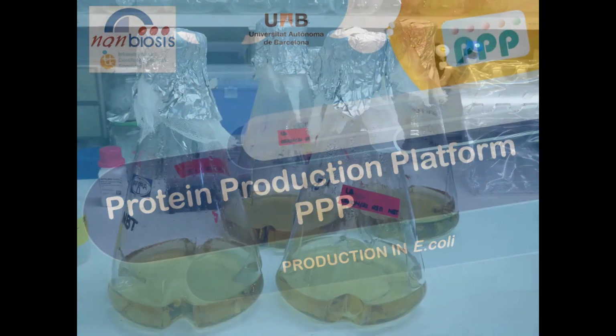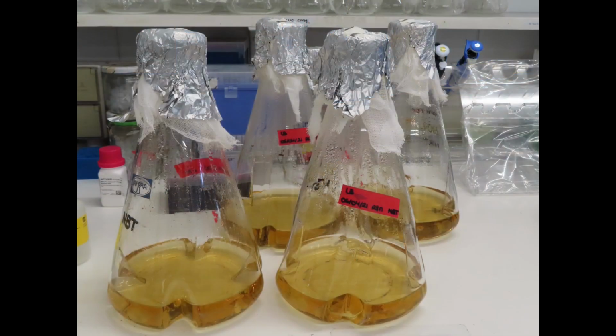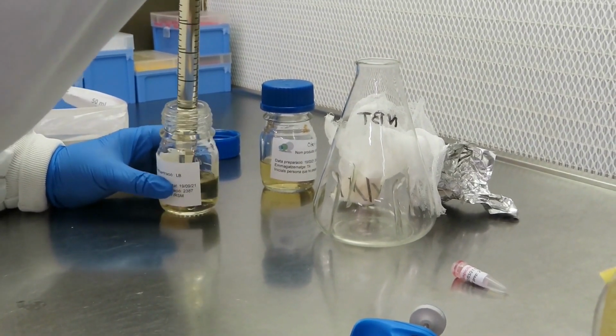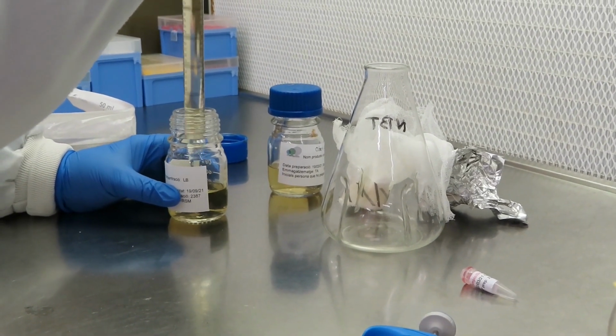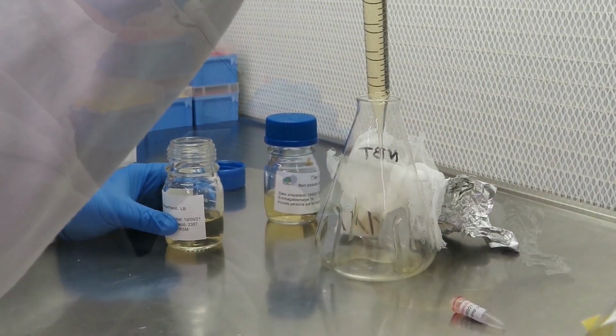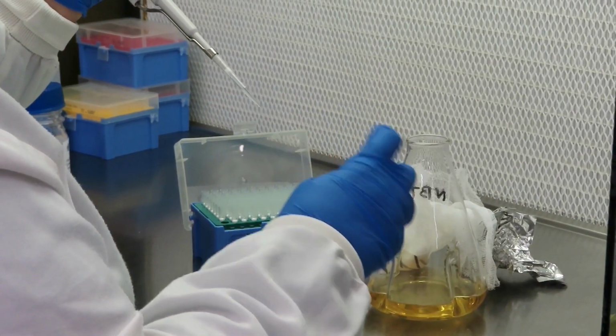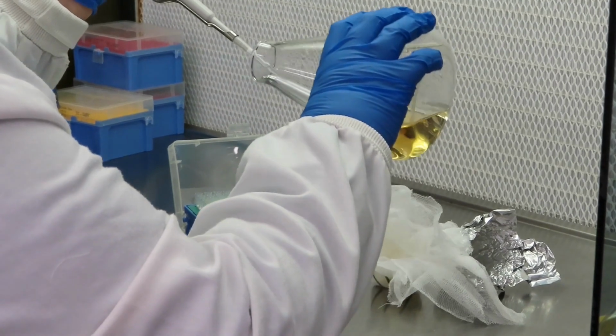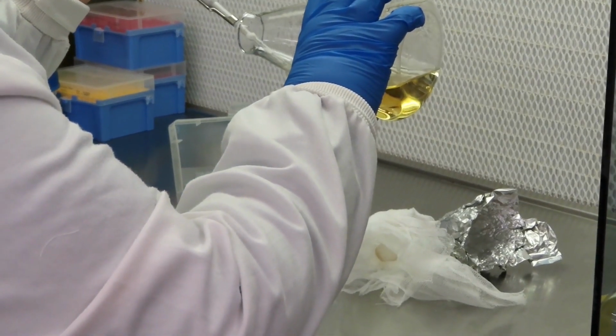Protein production in E. coli. As an example, we are going to show the steps to produce a specific protein in 2 liters of E. coli batch culture. Since this is a high volume, first it is necessary to prepare a pre-inoculum. In one flask, 100 ml of the culture medium, in this case Luria-Bertani LB, are added. The antibiotic, in this case ampicillin, is added to the medium to selectively allow the growth of cells that have the plasmid with the antibiotic resistance.